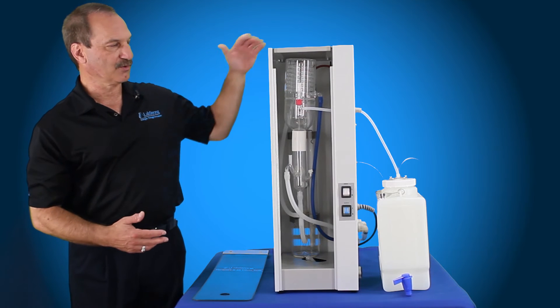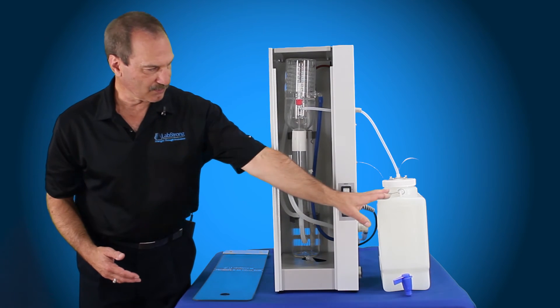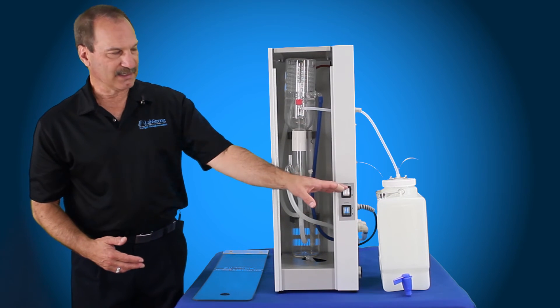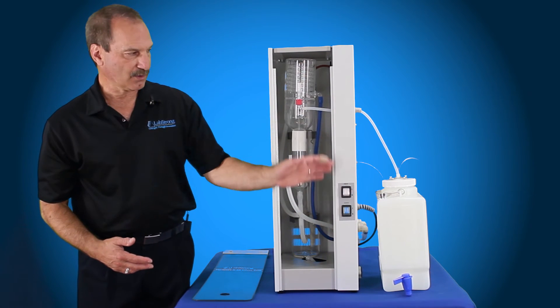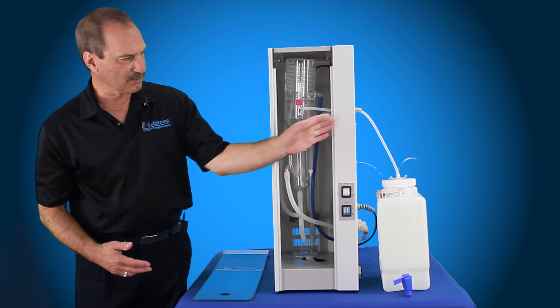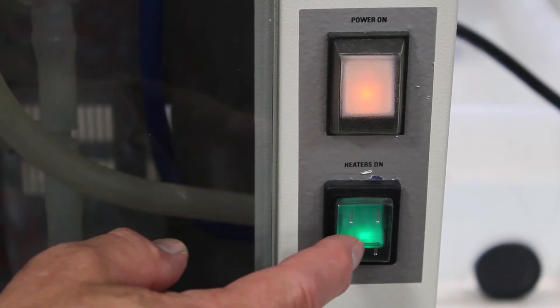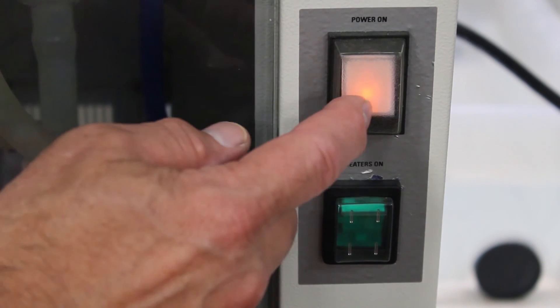At that point it's going to start creating your steam. It's going to fill up your tank that's connected to the side, or if you don't have a tank connected you just have a carboy — you're going to go ahead and route your distillate tubing to that carboy. You manually have to shut off the heat switch and the power switch to shut it down when the tank is full.